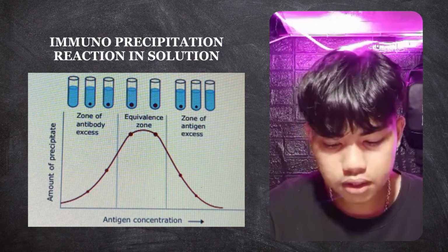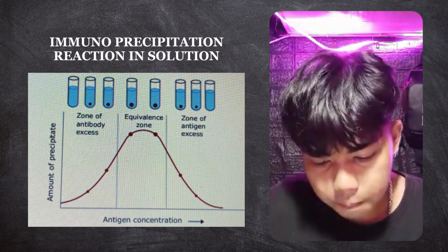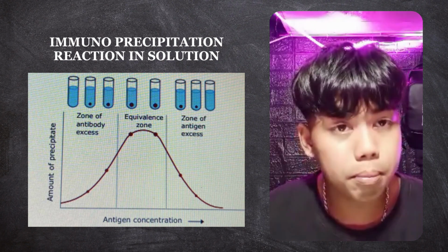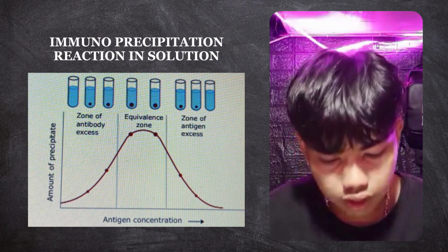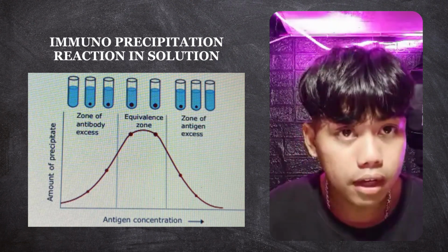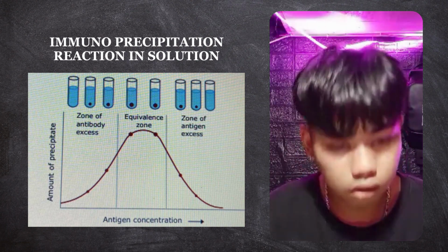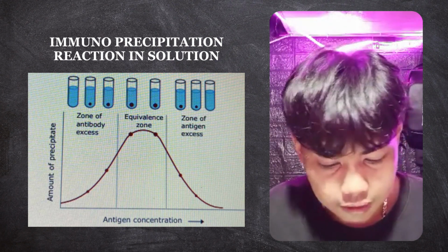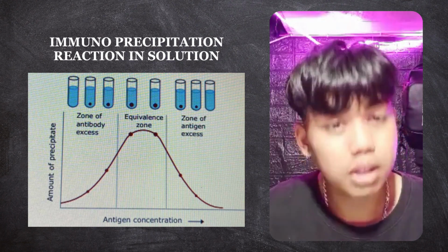Next one is the gel electrophoresis. Sample preparation. The eluted samples are denatured and prepared for gel electrophoresis by adding a loading buffer containing SDS, or sodium dodecyl sulfate, and mercaptoethanol. SDS denatures proteins and imparts a negative charge proportional to the protein mass.